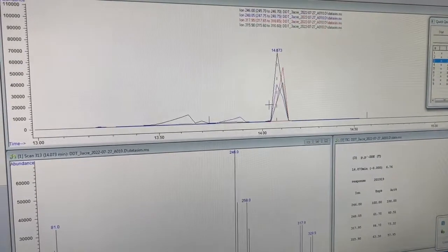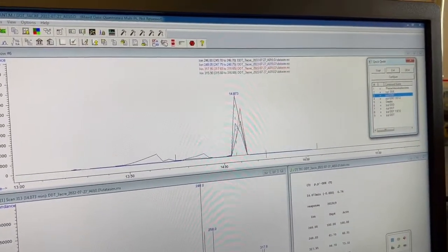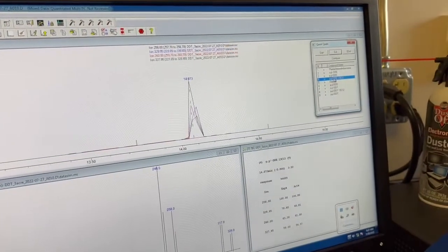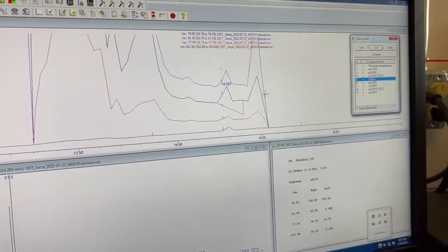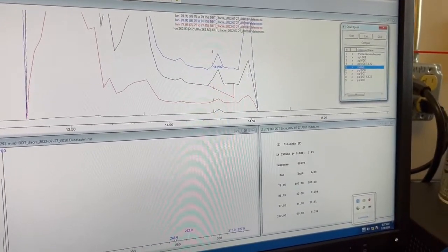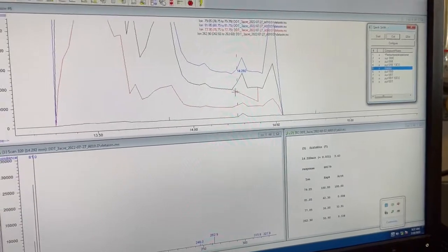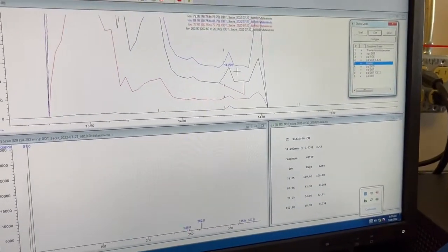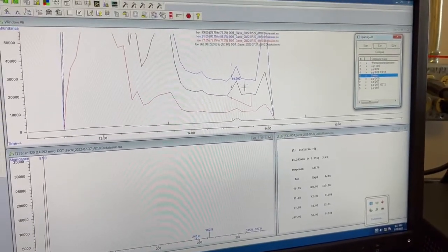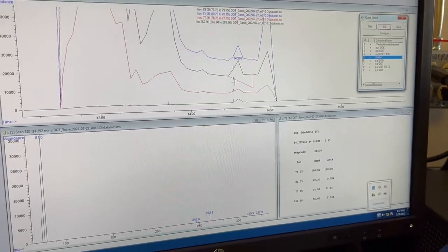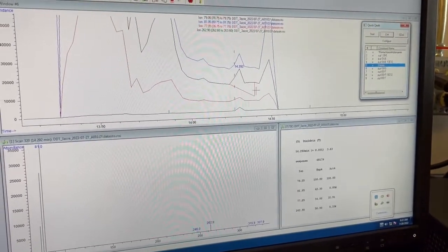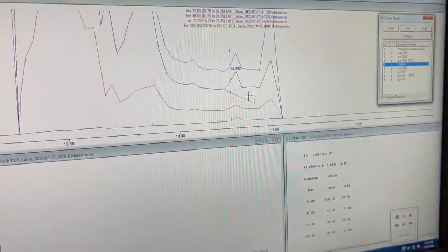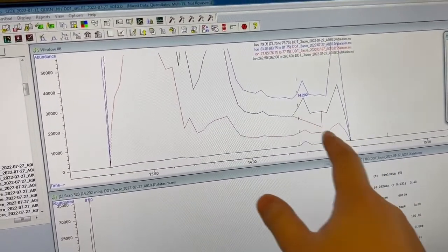But this is also going to be one of your species that's at higher concentration. So that's why it'll be a lot easier. Our surrogate also looks great. Dildren. Yeah, that's it. So this is where River and I had problems. We did this differently. Dildren is very small. It's the smallest of all of our peaks, just in any sample set, even in the standards. And so in our worm samples, it's also the smallest. So you can see the computer did this integration really dumb. Like this is not Dildren.